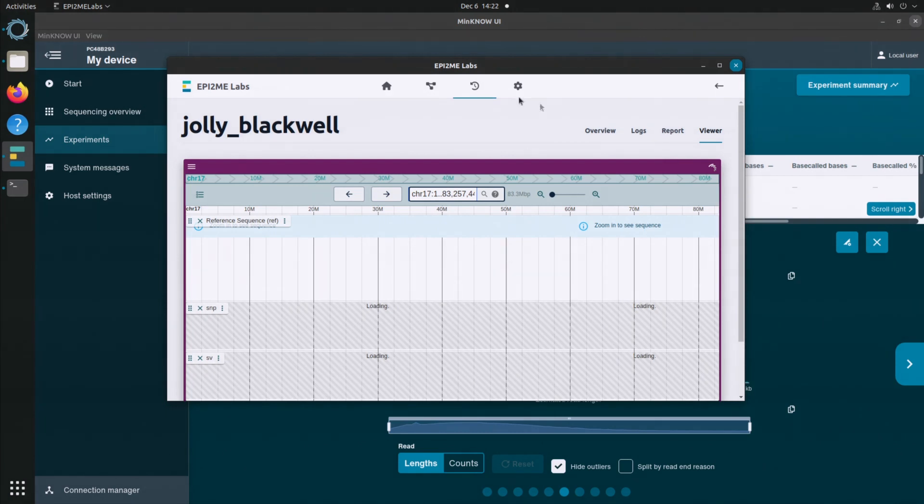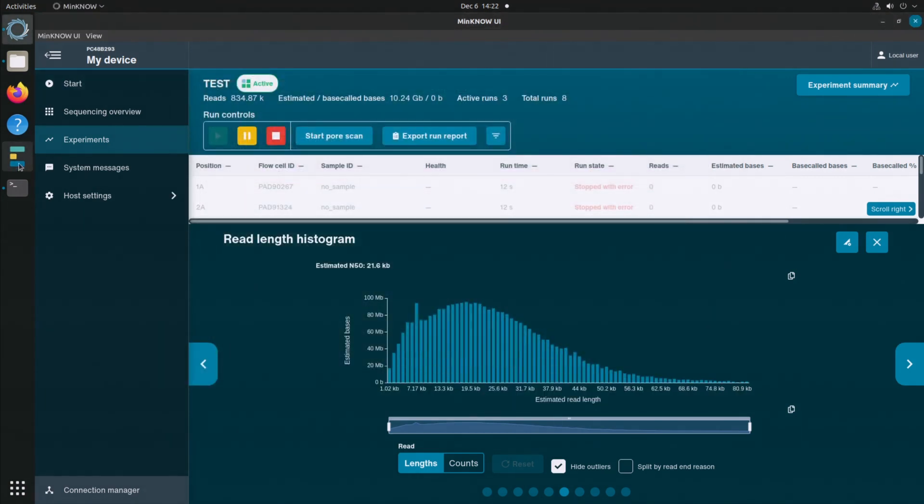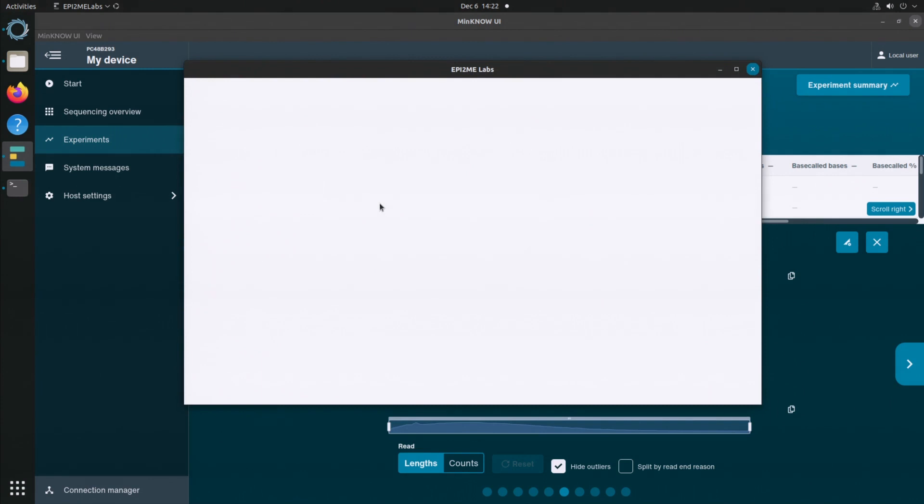This is EPI2ME Labs 4, released today — even better than the previous version. Some functionality that could be really useful for you is that you can now run your own workflows in this software. This means that you are no longer limited by what we can write.